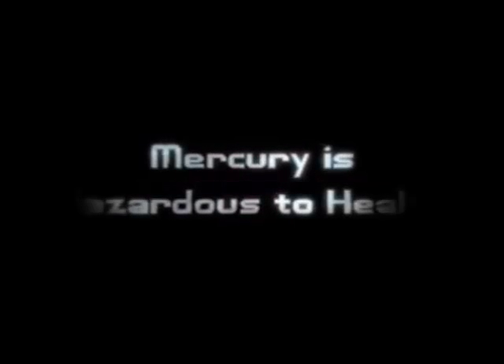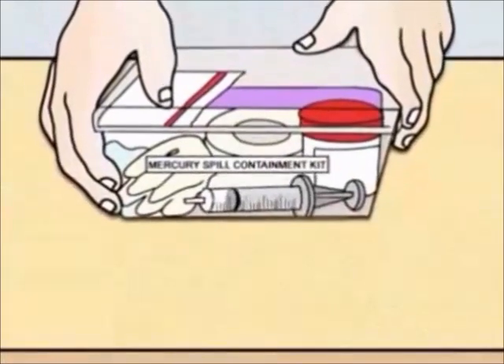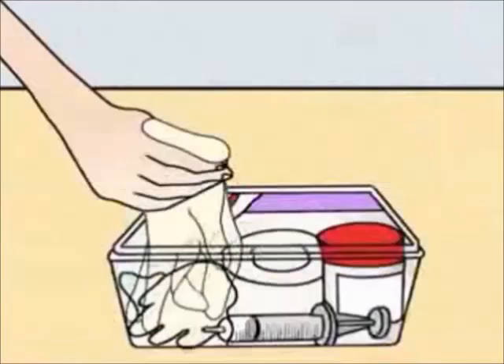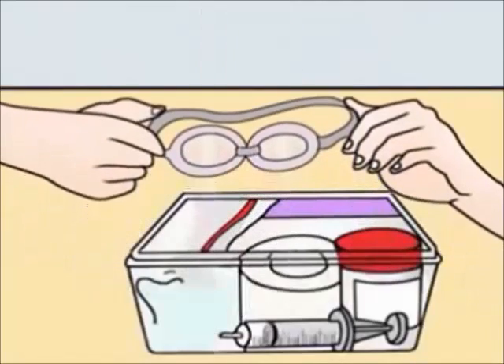Mercury is hazardous to health. Every laboratory must have a mercury containment kit to deal with a mercury spill. A mercury containment kit must include two pairs of gloves, a face mask, a syringe, a pair of protective eyeglasses, two stiff pieces of cardboard, two plastic bags, a surgical tape, a torch, and a container half filled with water.